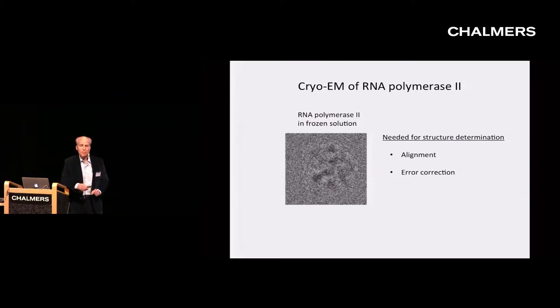Now, you will also doubtless realize that alignment must be very precise, nearly to atomic resolution, if one wishes eventually to recover a structure from averaging many images that is good to that resolution. The problem is made still more complicated by the flexibility of the protein. RNA polymerase, like many large molecules, exists in multiple conformational states in solution.